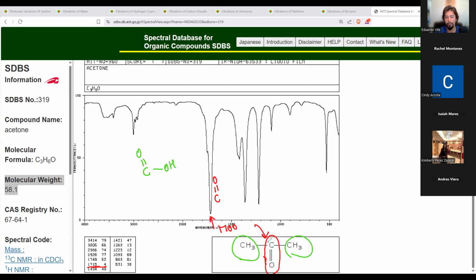And then what else are we expecting to see? There's nothing really else, right? There's just a CH3. So maybe these right here are your CH3s, right? So there is a little more going on here, but I'll let you guys think about that for the next few weeks. And then I might ask you a question about some other peaks that are showing up here.